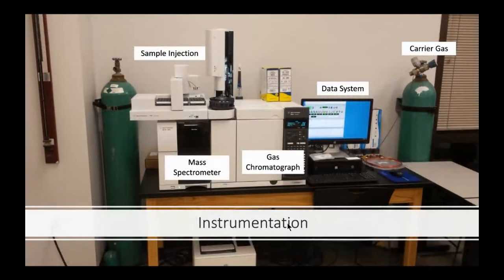So let's get into more detail of the instrumentation. This is a picture of the instrument that we have in MS212. There are a number of parts up here that you'll see in another diagram coming up, but I just wanted to point them out so in case you come into the room, you'll know what the system is designed for and have all the parts for it.